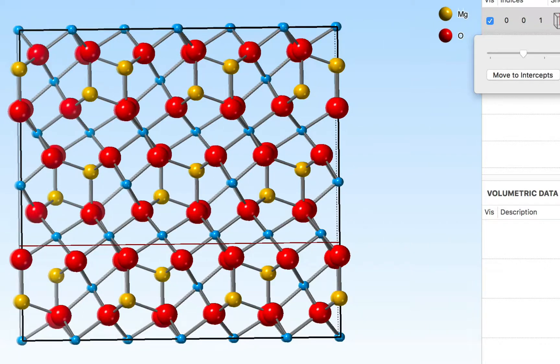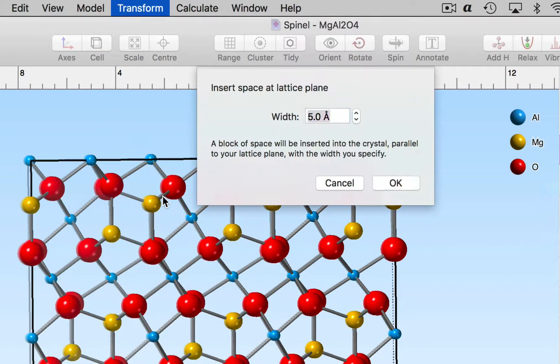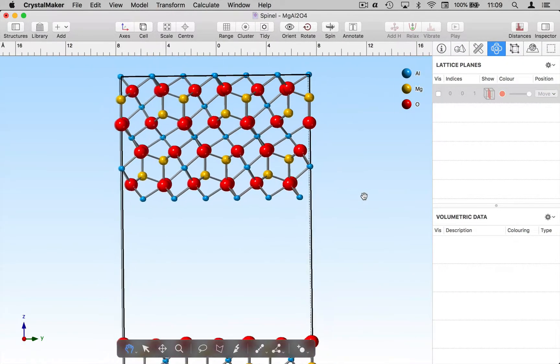I can insert space using the transform menu, insert space and I'm prompted to specify how much space we should insert. I'm going to insert 10 angstroms. So click OK and now we have a larger unit cell with some space showing.